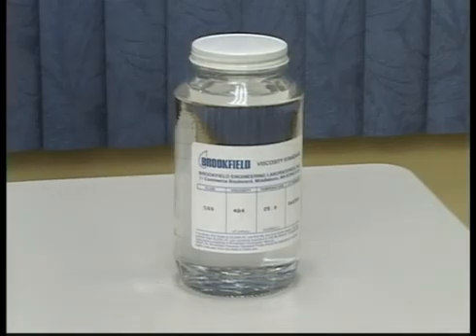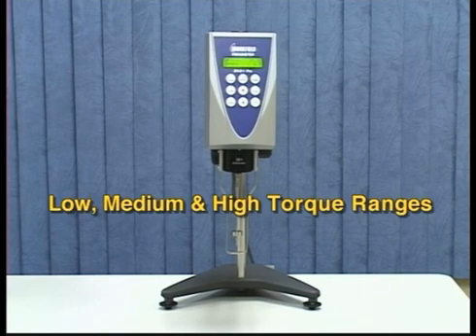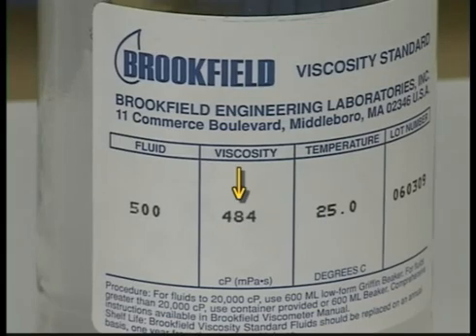You do not need to select a standard fluid based on the viscosity value of your material. However, many customers choose to do so as a simple verification. The calibration routine checks the linearity of the spring on the instrument by using one fluid at three separate speeds to achieve low, medium, and high torque ranges. This checks the linearity of the spring and the sensing mechanism of the instrument. Use the actual value of the fluid, not the stated value, for the calibration check.